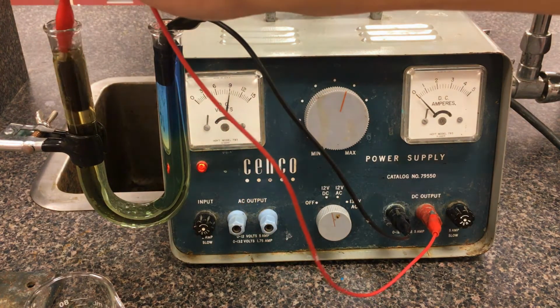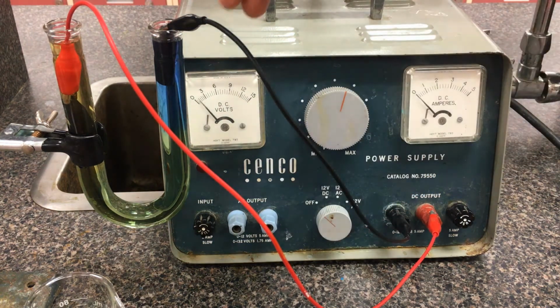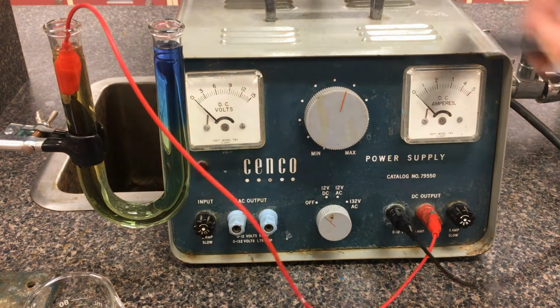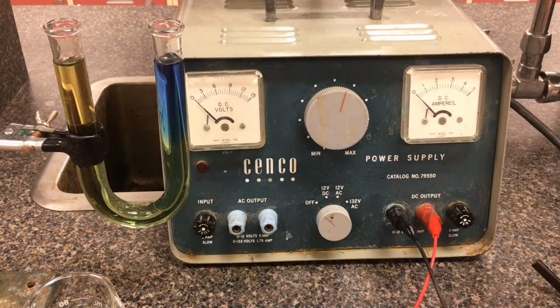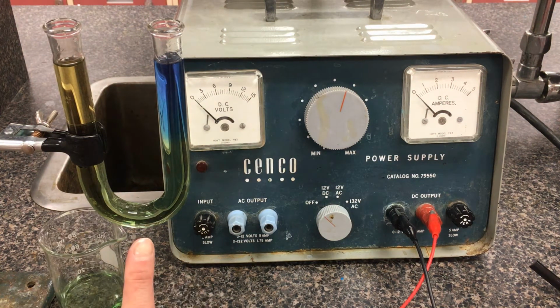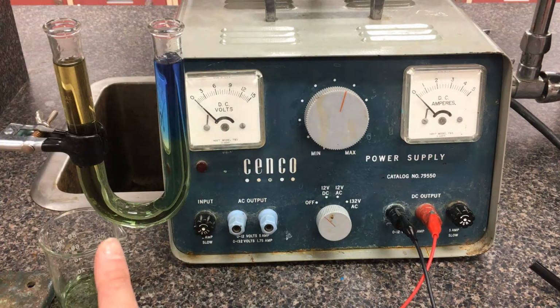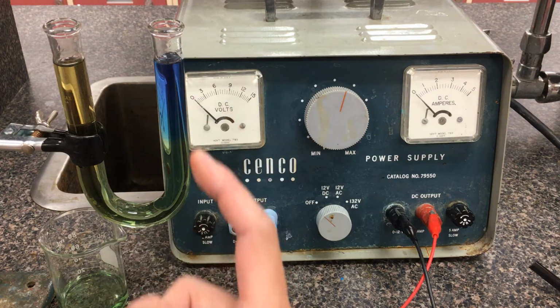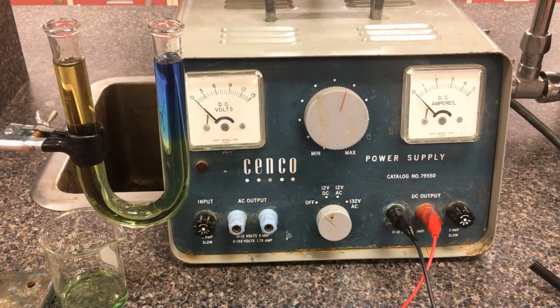So definitely a notable color change here. Just going to turn off the power supply. I'm going to pull out these leads so you can make another observation. And there we go. Hopefully you can see the initial green color that it used to be, still at the bottom here. Those ions haven't completely migrated after the products have been formed, but this side is definitely notably bluer, and this one is definitely notably yellow. Okay. Thanks, guys.